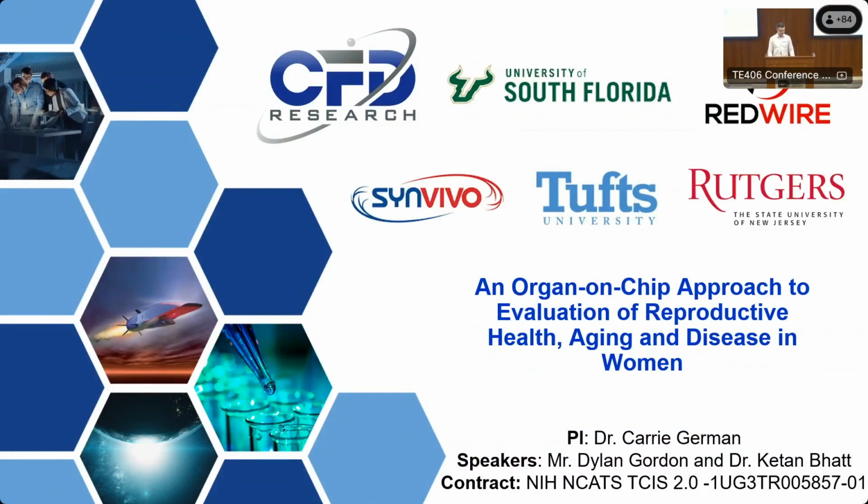I'm here to present the work that we've been doing for Tissue Chips 2.0, and we are developing a uterine model to assess the effects of aging and reproductive health and disease in women, especially considering microgravity effects on these things.